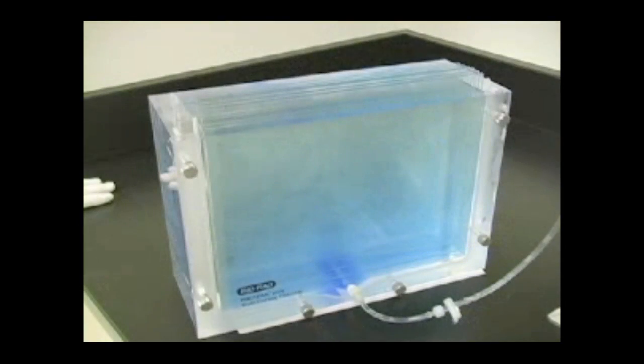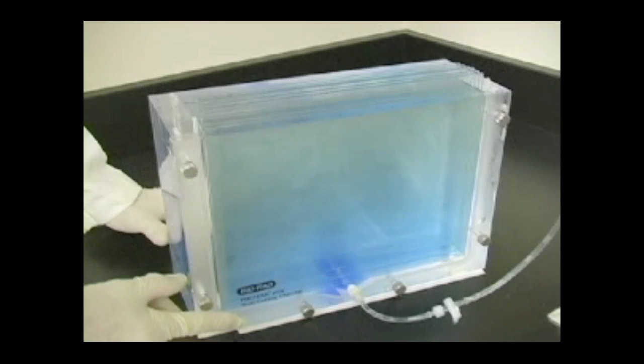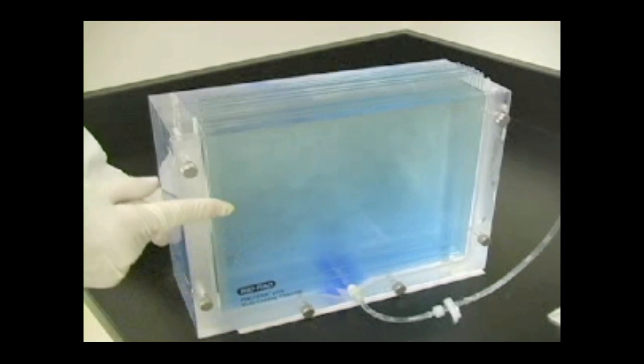You can see that the finished gel is darker in color on the bottom and gradually gets lighter toward the top, showing that a gradient has been formed. Once again, we artificially colored the heavy solution blue, so your gel will be clear.